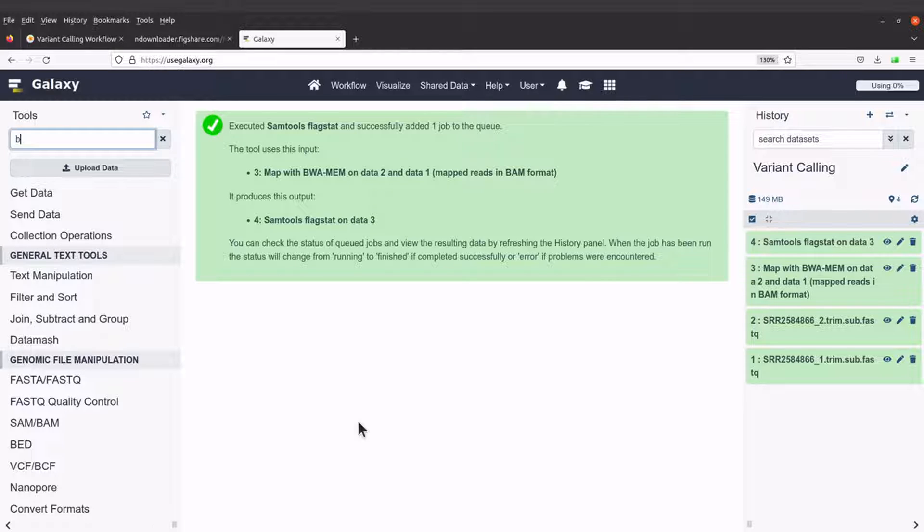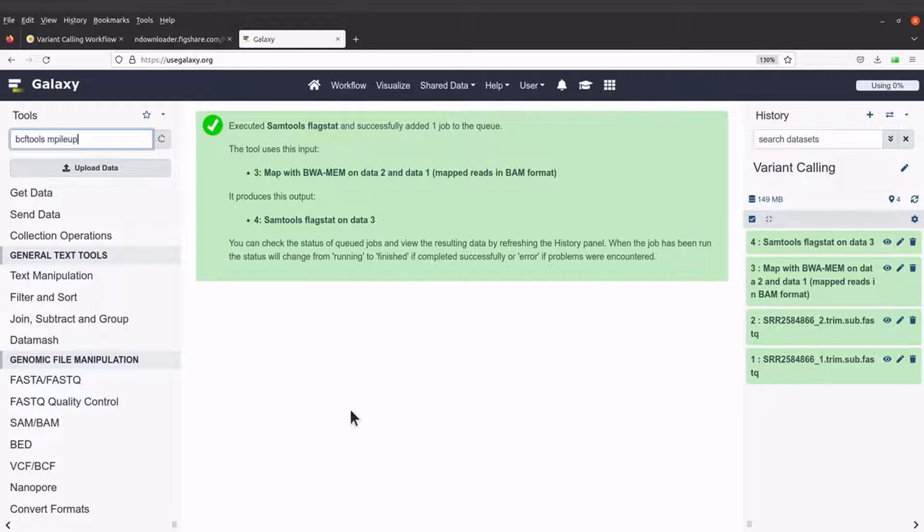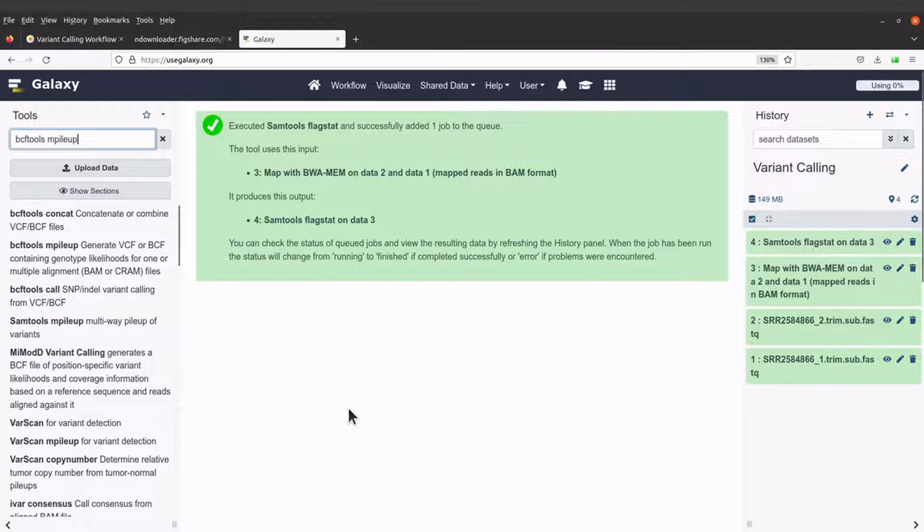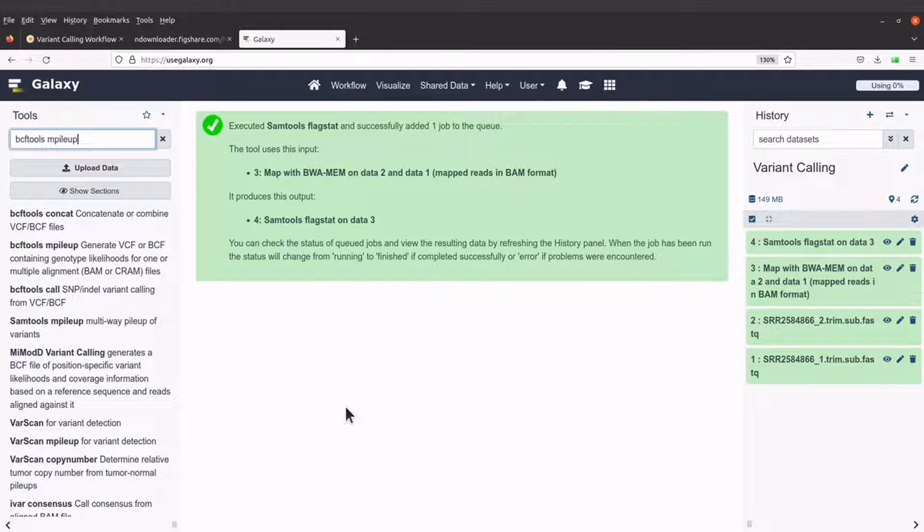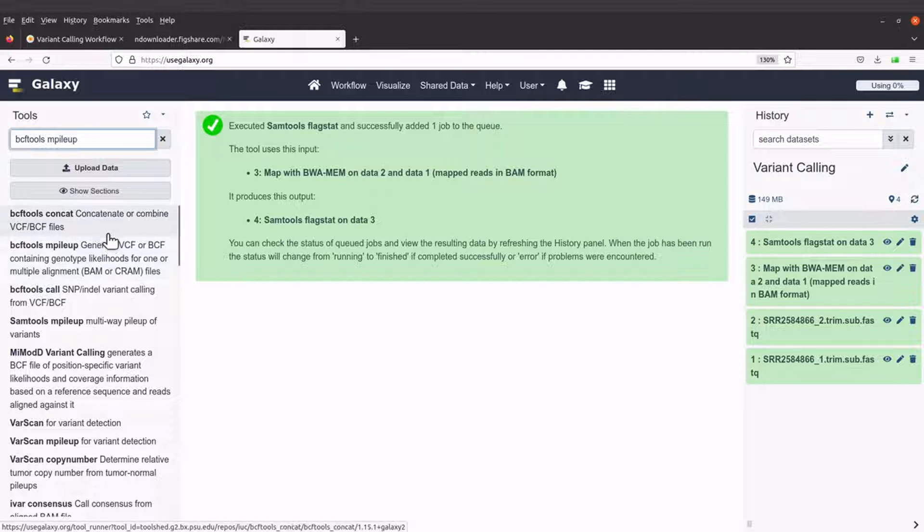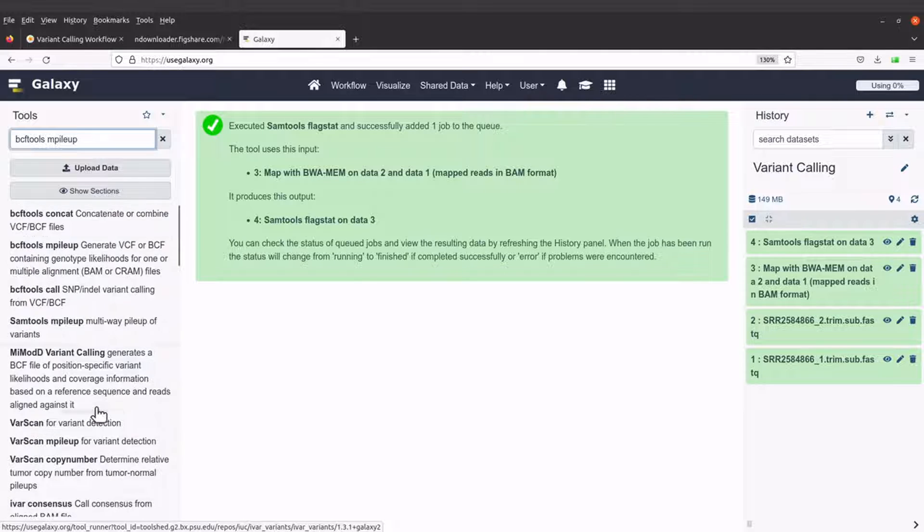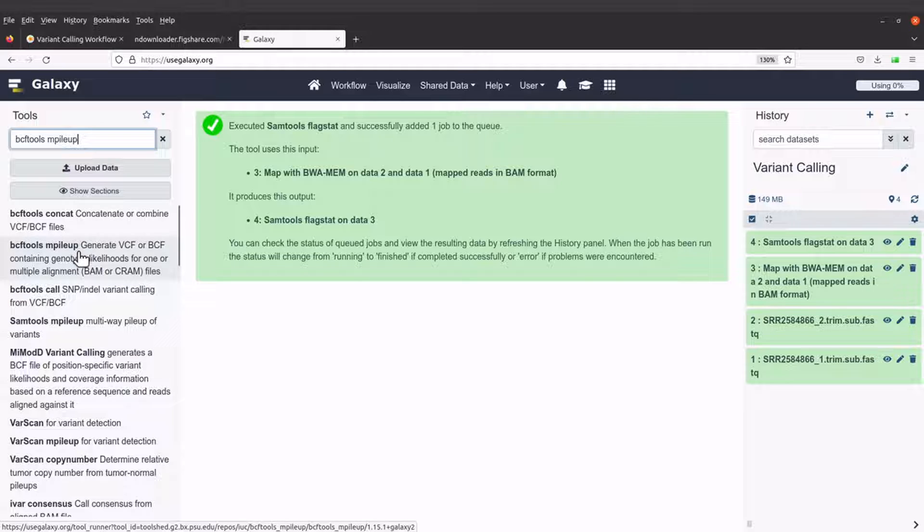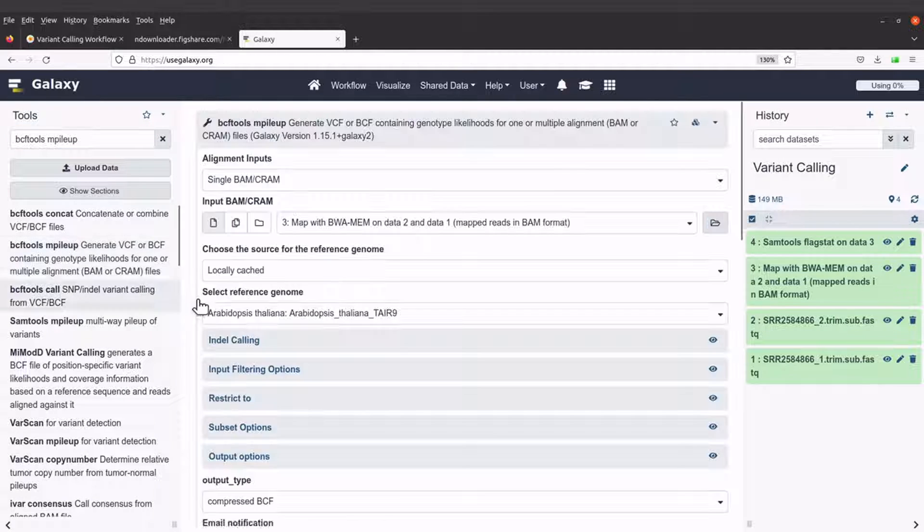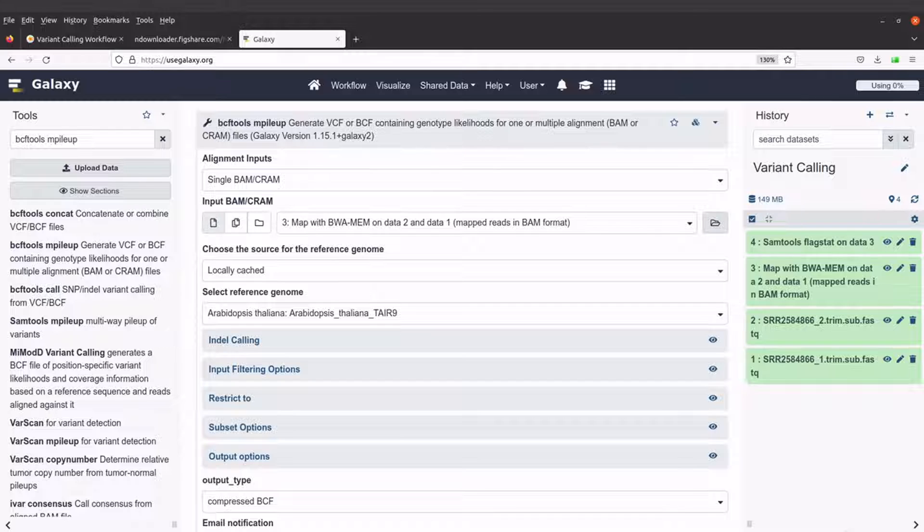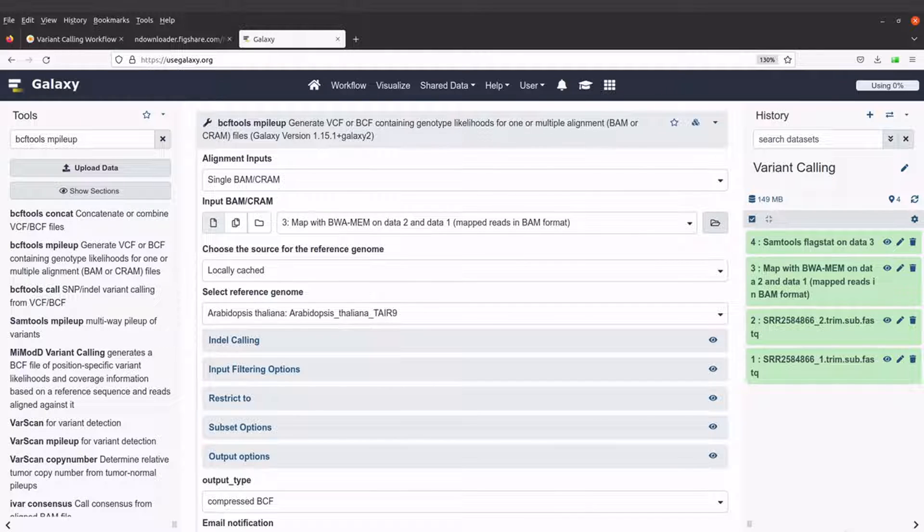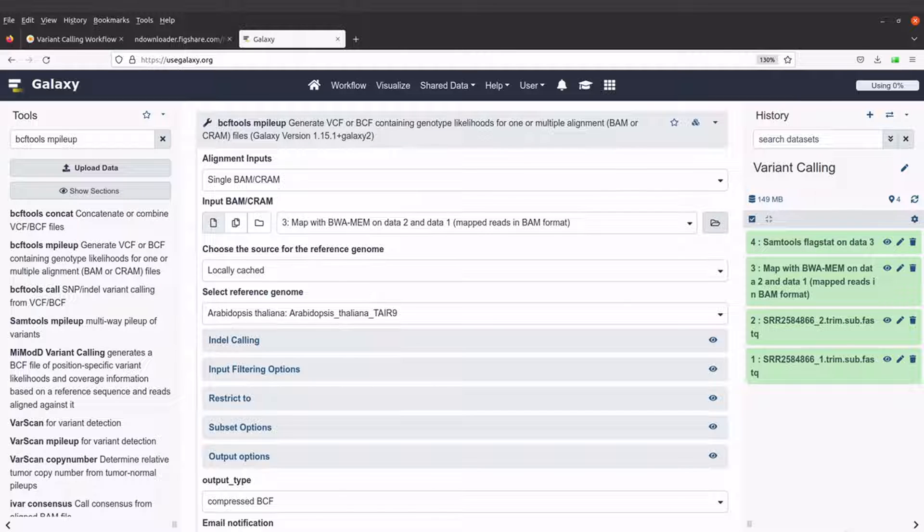So let's say bcftools mpileup. So this will bring up the bcftools mpileup tool. If you don't see it here just search and then you'll find it. So yeah, so this is it. So we should click it.